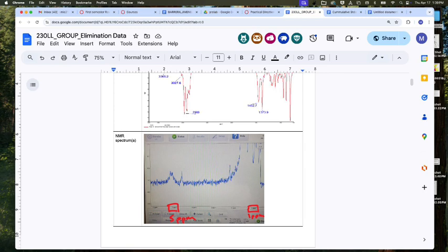Within this spectrum that we're looking at, a couple of things I want to point out. Number one, you can see that the spectrum is entirely cut off. Part of the spectrum was something we decided we could ignore. We'll talk about why in a second. We zoomed in right here to evaluate this. This is really setting us up with two signals. We'll call one about 5.2 and the other one about 4.7. Those two signals become important, and we'll talk about why in a little bit once we address them. That was the point of the zoom in, to see those.